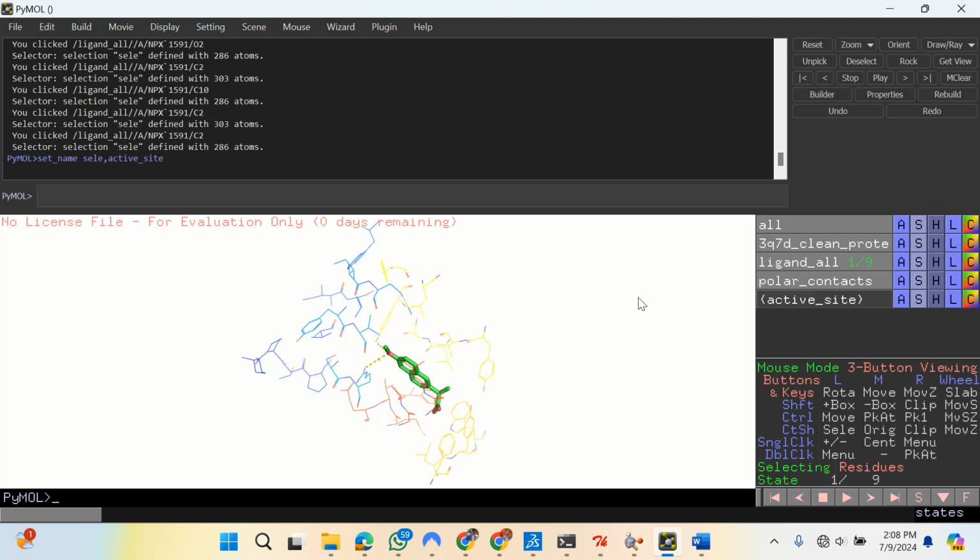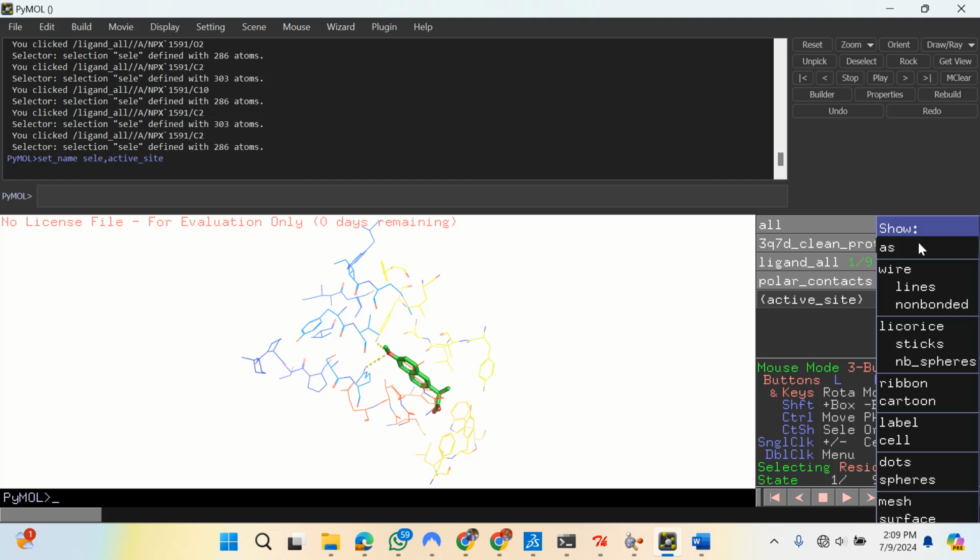Is that fine? Remember, I just hit the cartoon. I did not delete it, right? So if I show it, it will still appear, right? So are you lost? Okay, so I will go to the same protein and now I will show. But this time I don't want to show it in cartoon. I want to show it in surface view. I prefer surface view to cartoon view. Surface view will expose the pocket well, better than the cartoon.